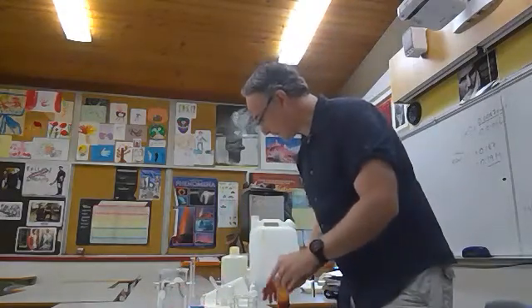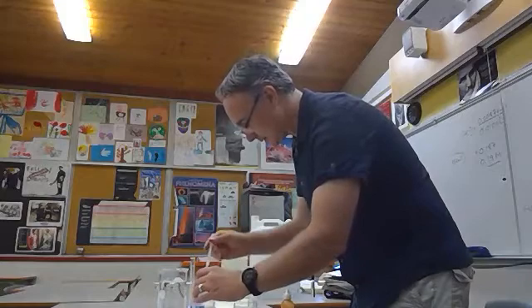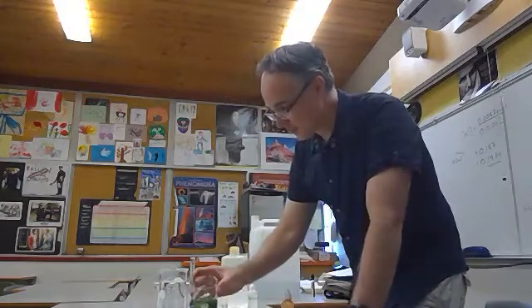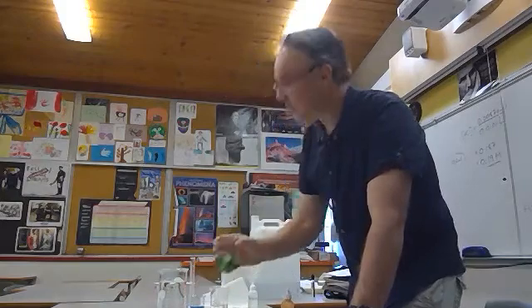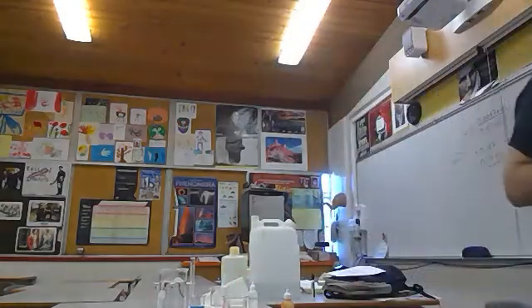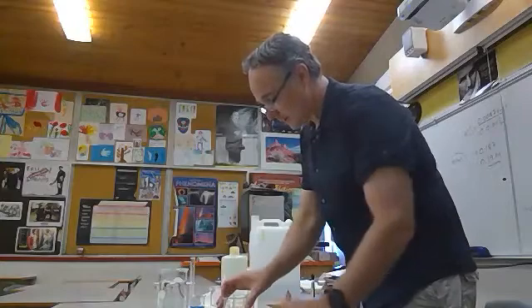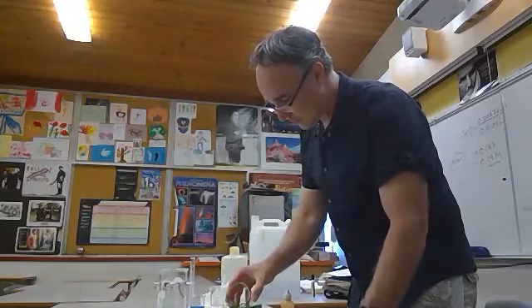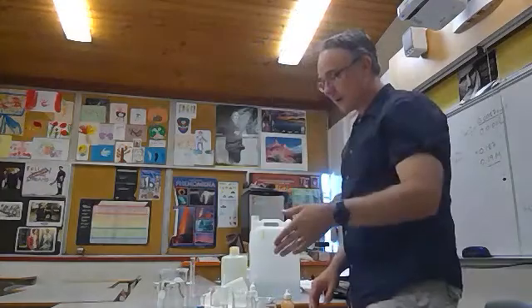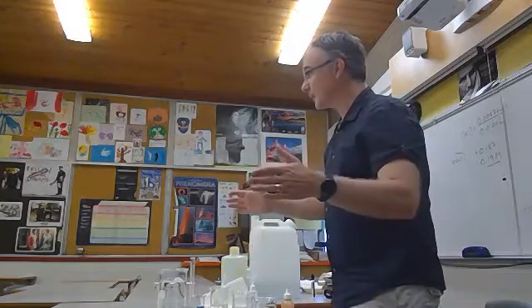And then if I have, say, some acid, so if I add universal indicator to an acid, it goes a red kind of color, it turns red. And then if I take a base and add it to a base, it goes purple kind of color. And that's actually a strong base, that's a strong acid. And so if you were to use a weak acid, you actually get a yellow color. And if you use a weak base, you get kind of a blue color. And it has this whole spectrum of colors that you can work with here.